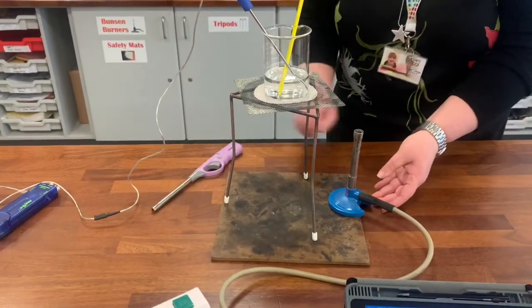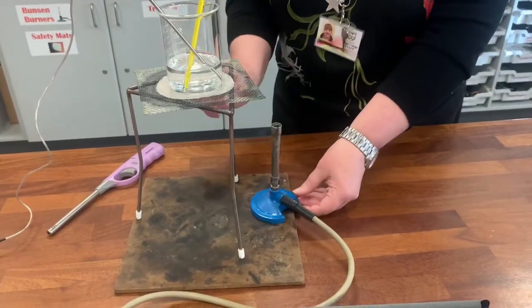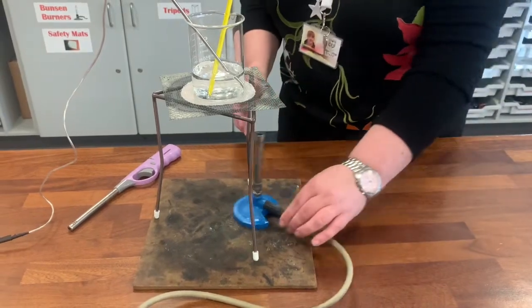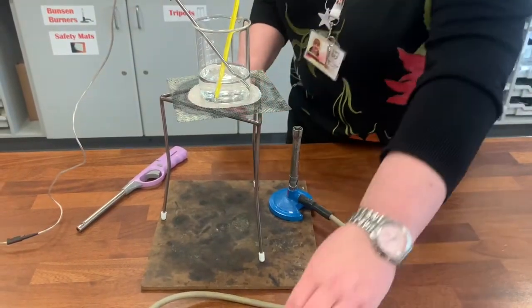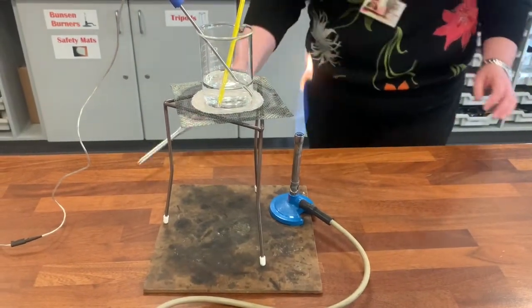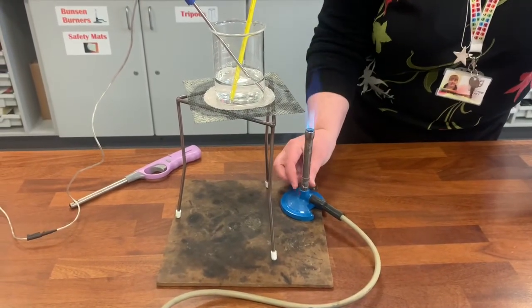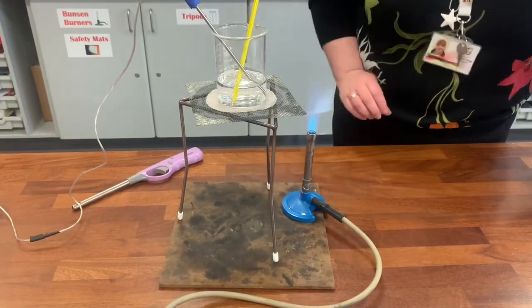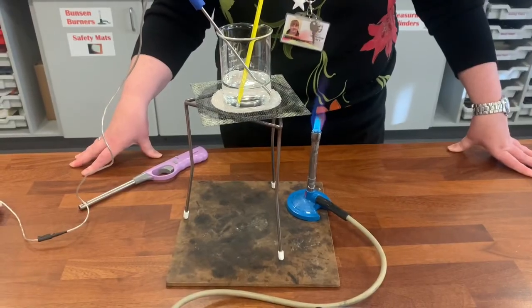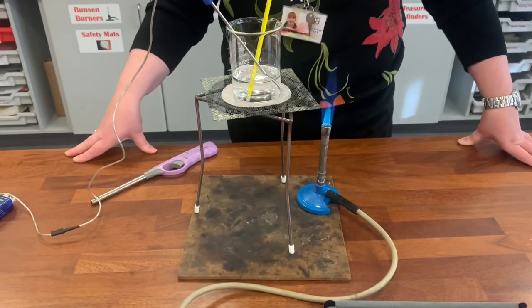When lighting the Bunsen burner, remember we have the air hole almost closed. With this setup, we don't have the Bunsen burner underneath the tripod — we have it off to the side, and once it's lit we push it underneath. Air hole almost closed, turn the tap on, stand back, and light it. Because we're heating a liquid, we're going to have the air hole just about half open — not fully open, just about half open. We're going to put the camera in position and time it for eight minutes, just like the results are on page 15.